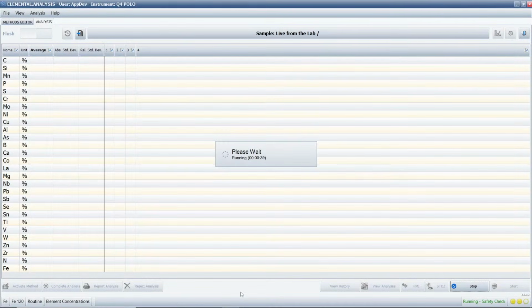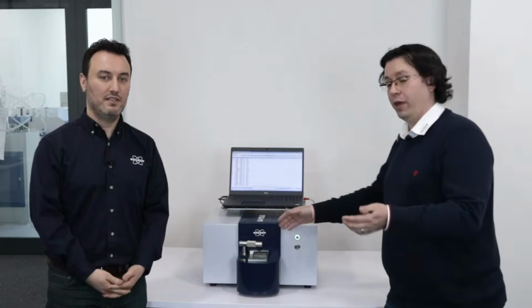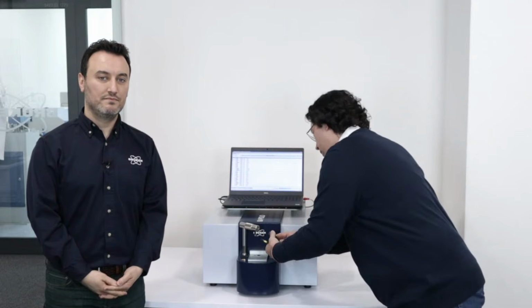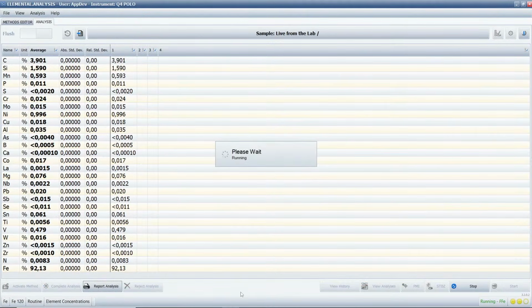Yeah. And which also defines the application in the end, because the main applications for cast iron are for diesel engine motors, or frying pans that you have in your kitchen. So yeah, and also for pipes applications and so on. We basically use OES to define the chemical composition, as Okan explained.